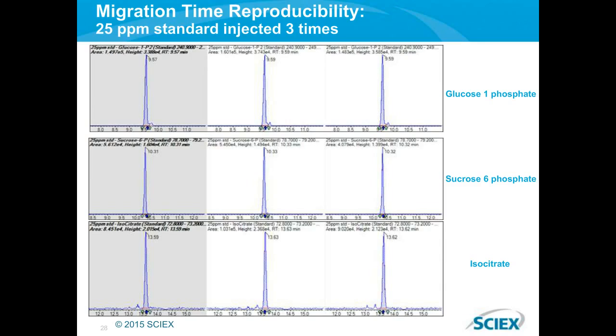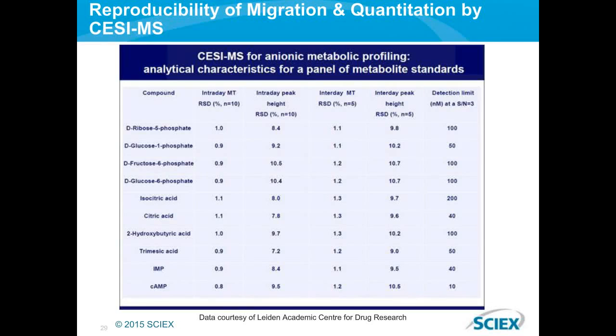And actually the calibration lines I've shown you during this presentation are from multiple injections of the same standard and different standards. So these are not just simple one-point calibration lines, they're for multiple injections of the standards.